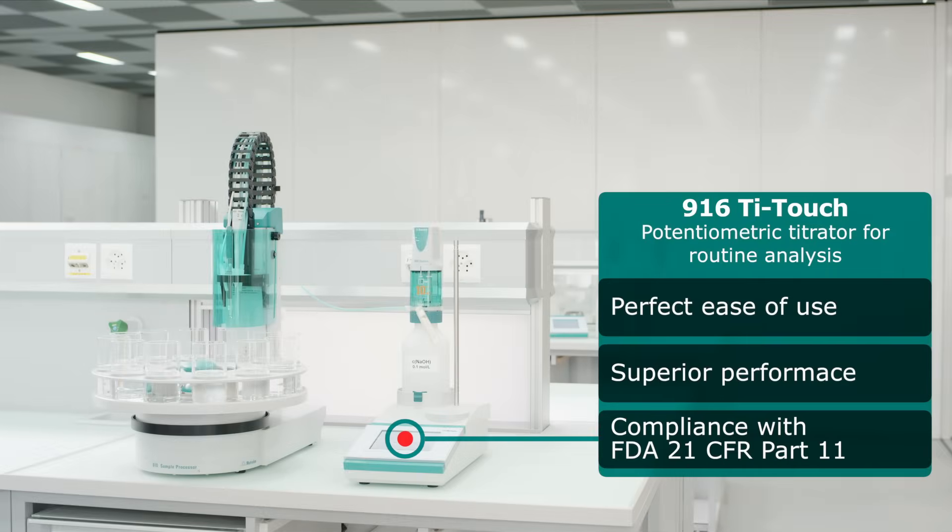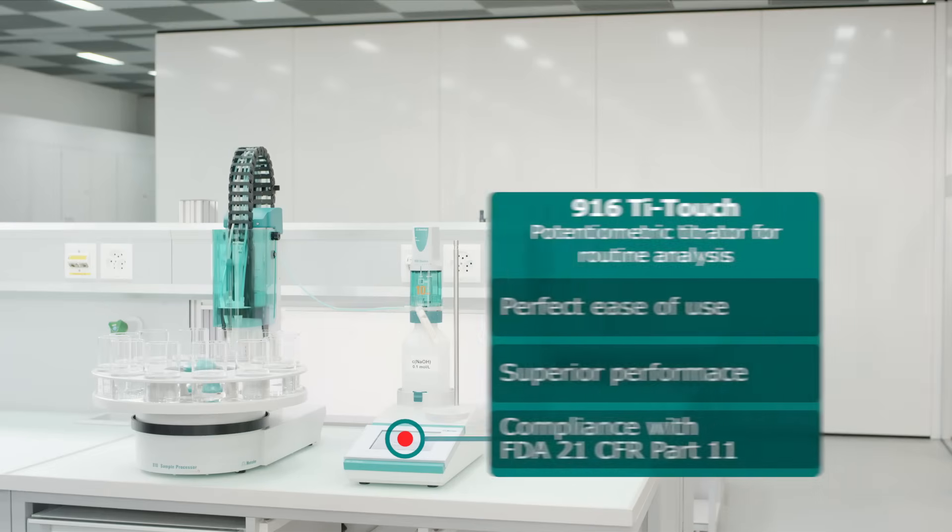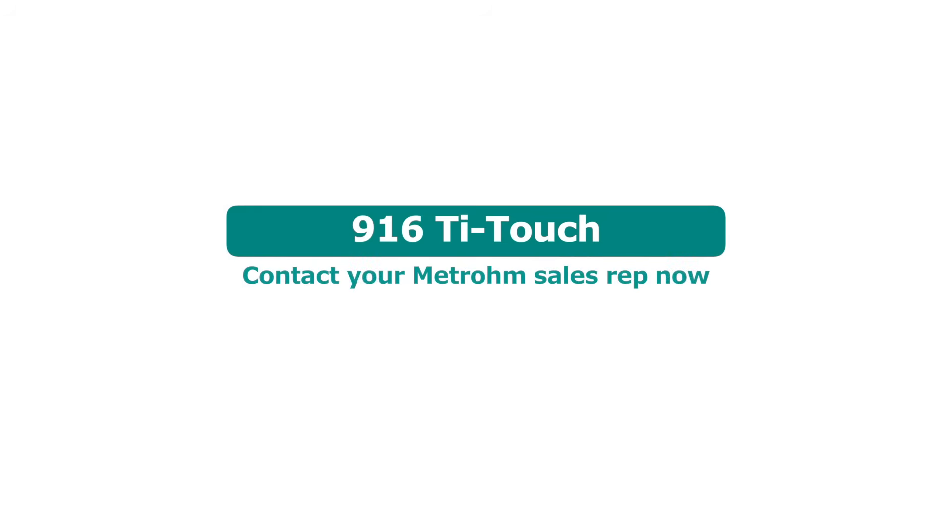The 916 T-Touch: perfect ease of use, superior performance, compliance with FDA 21 CFR Part 11. Contact your Metrum sales rep now.